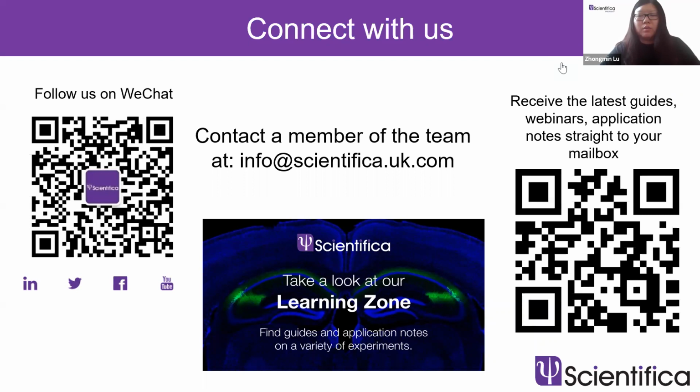Actually, we have customers demonstrating that using galvo scanning in a spiral way, you can skip some pixels because there is nothing there, right? And they have shown that you can get a really high frame rate, like 100 Hertz. The downside is a small size of the field of view, like around 300 microns times 300 microns.